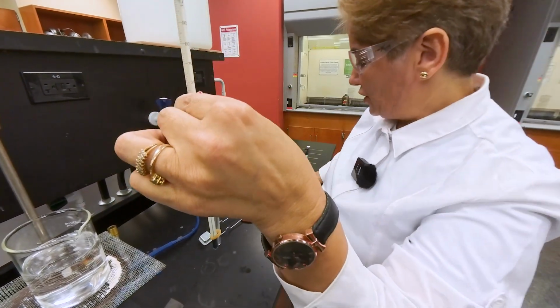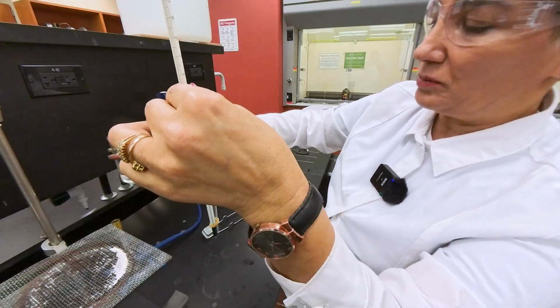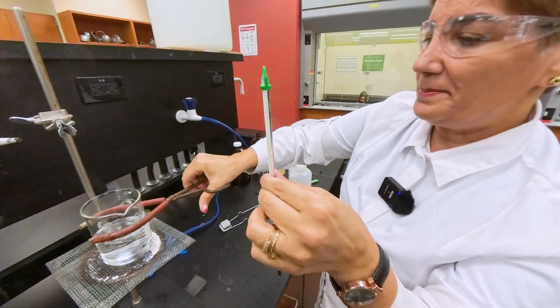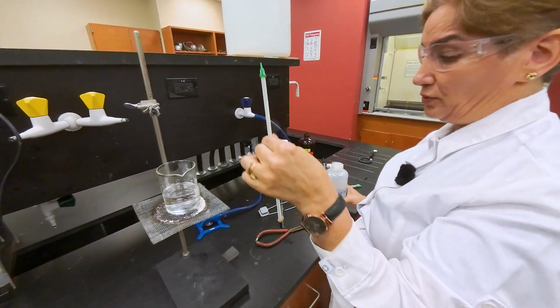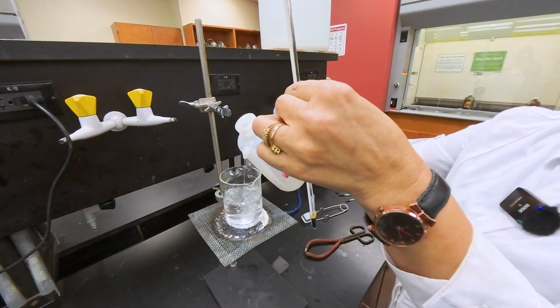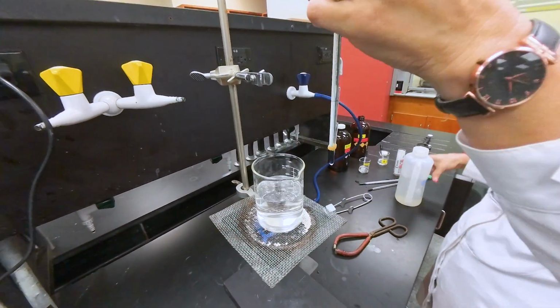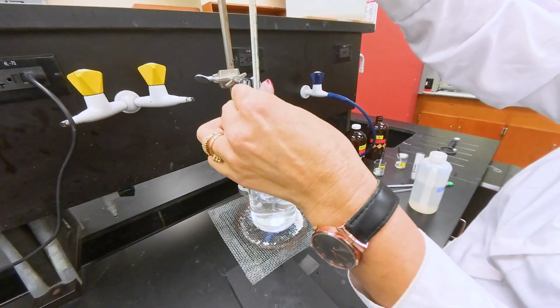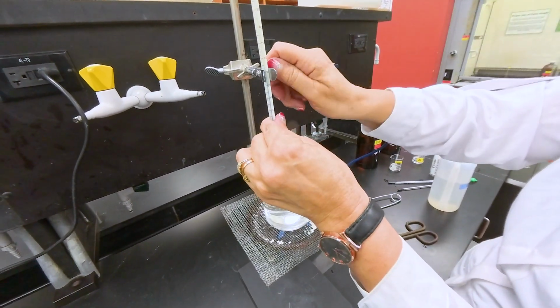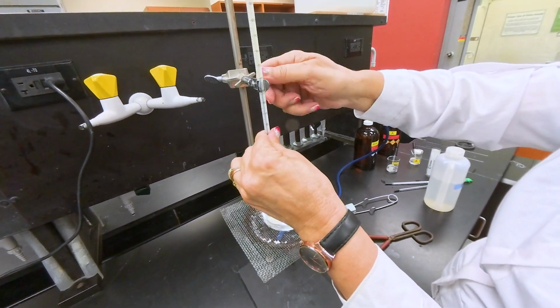The water bath that I used is already hot, so I'm going to add some cold water to it to make sure the temperature is not higher than the boiling point of my sample. What happens is, if the boiling point of the sample is less than the temperature of the water, as soon as I place it, it starts boiling. It doesn't give my thermometer enough time to adjust and show the actual boiling temperature.